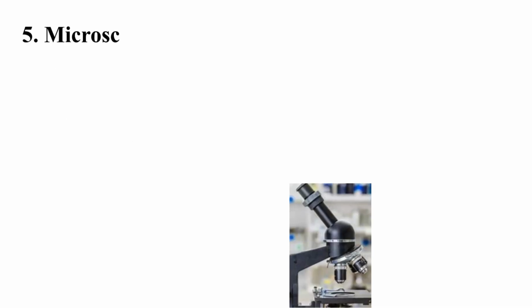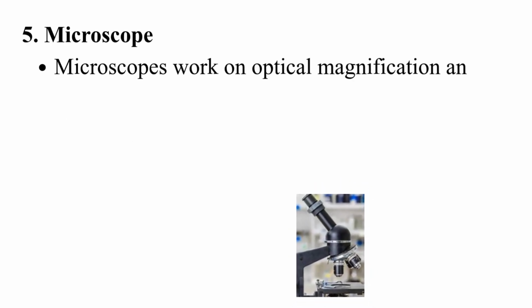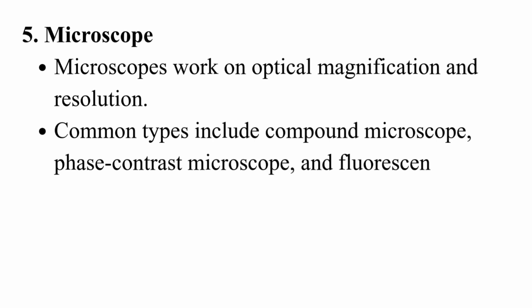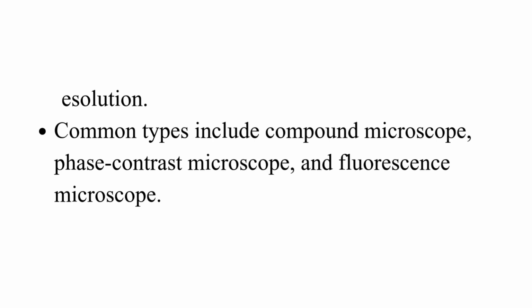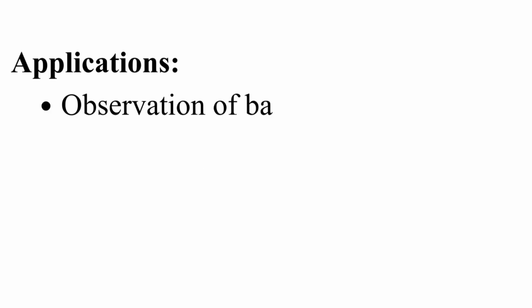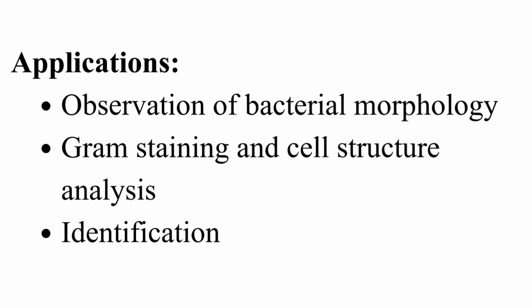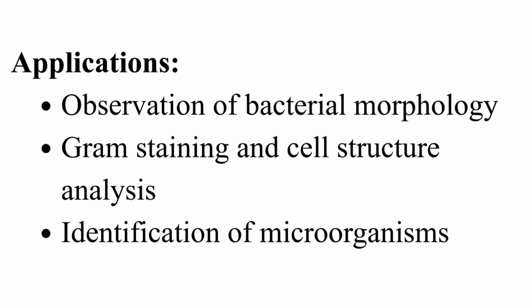Microscope. Microscopes work on optical magnification and resolution. Common types include compound microscope, phase contrast microscope, and fluorescence microscope. Applications: observation of bacterial morphology, gram staining and cell structure analysis, identification of microorganisms.